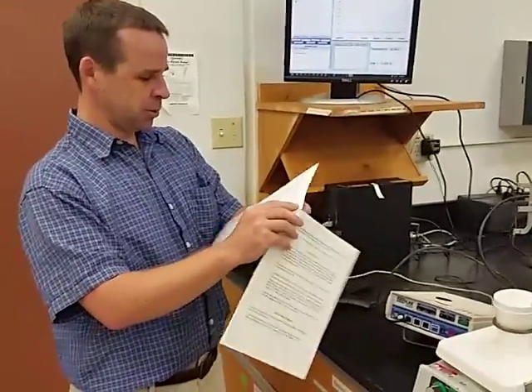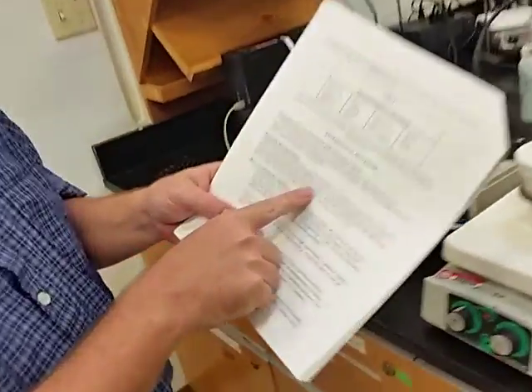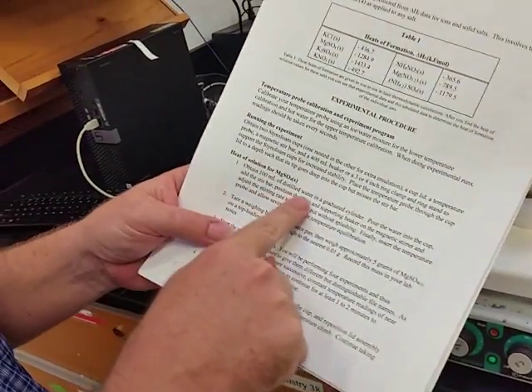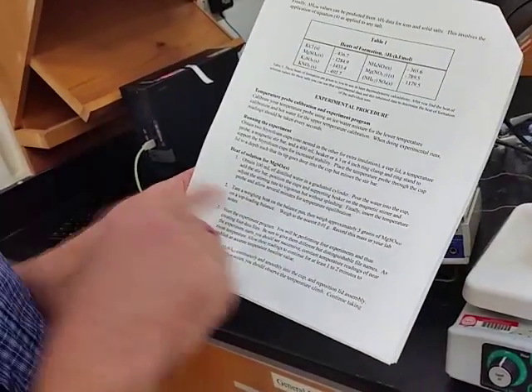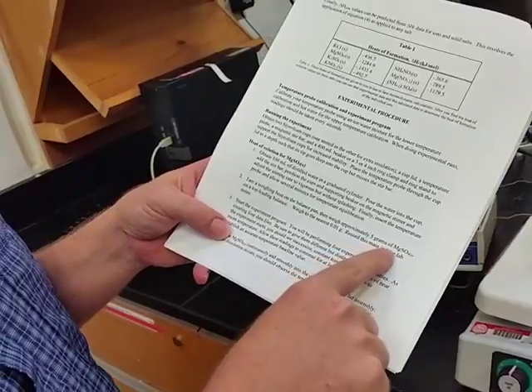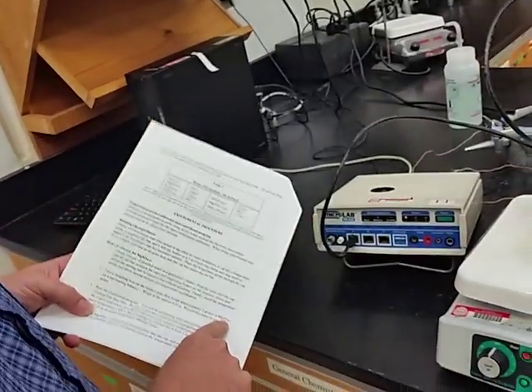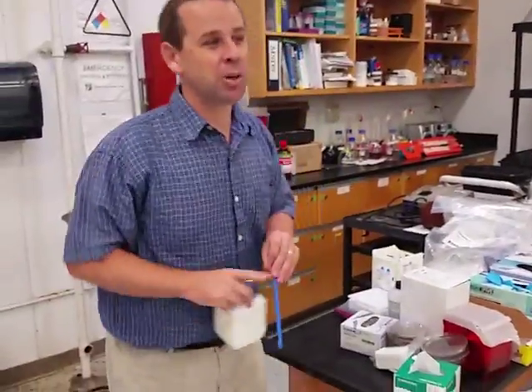following along the experimental procedure here, it says, running the experiment, here we are, right? 100 milliliters of distilled water in a graduated cylinder, pour in the water, right? Take a weigh boat, weigh to the nearest 0.01 grams of magnesium sulfate, all right? 5 grams of magnesium sulfate. So, let's see, do I have magnesium sulfate? Push pause.